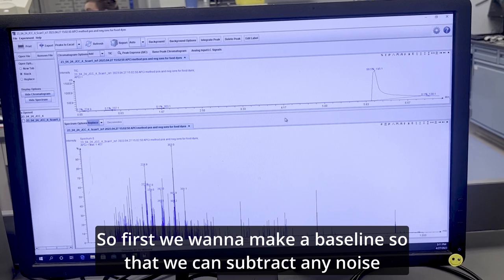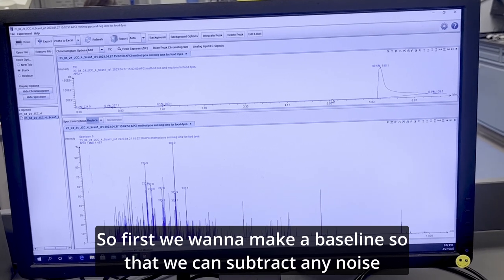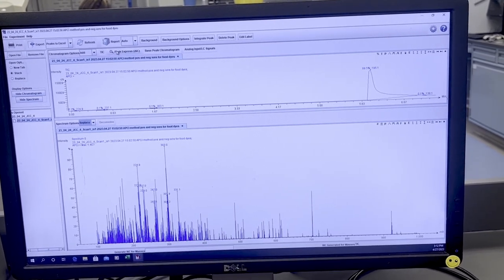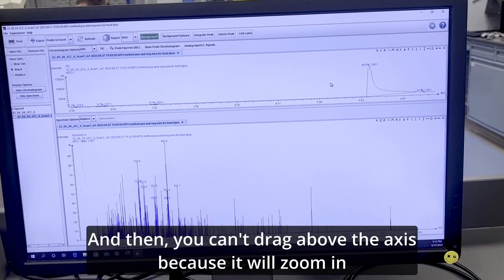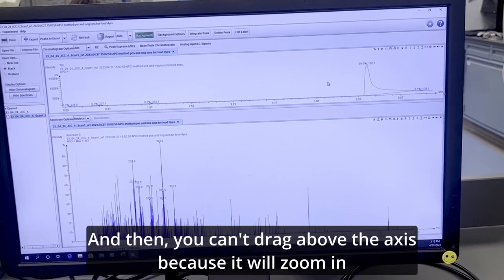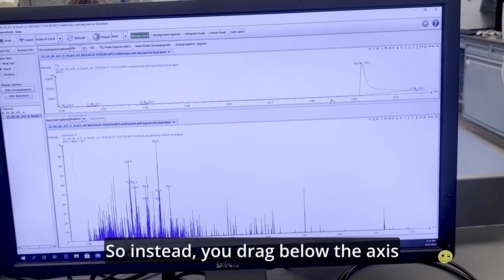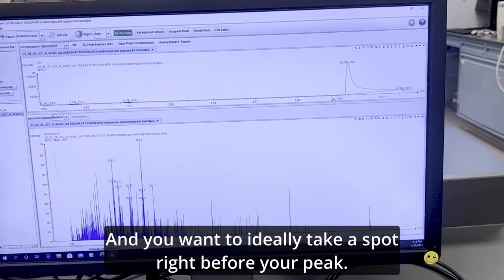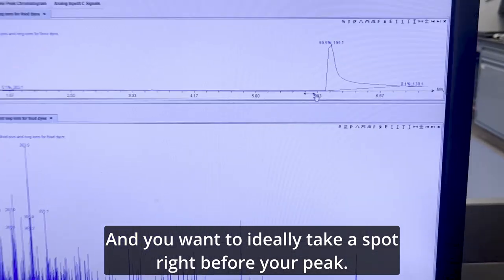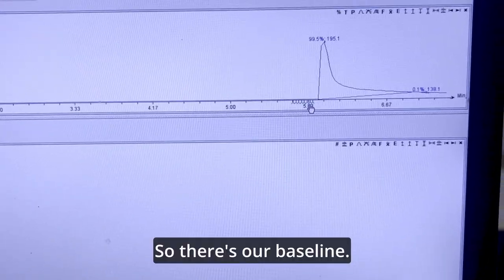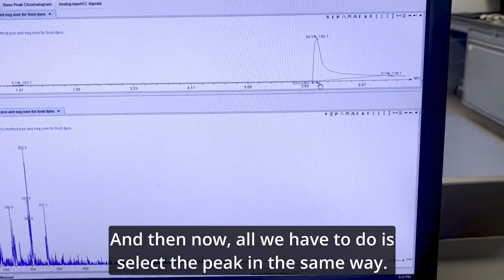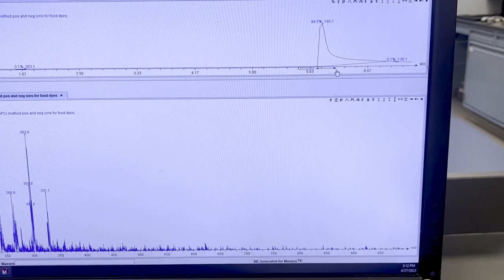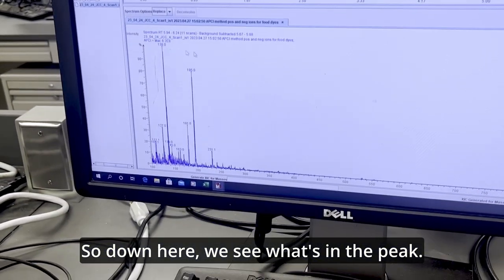So first, we want to make a baseline so that we can subtract any noise. To do that, we click the background button. And then you can't drag above the axis because it will zoom in. So instead, you drag below the axis and you want to ideally take a spot right before your peak. So there's our baseline. And then now, all we have to do is select the peak in the same way.